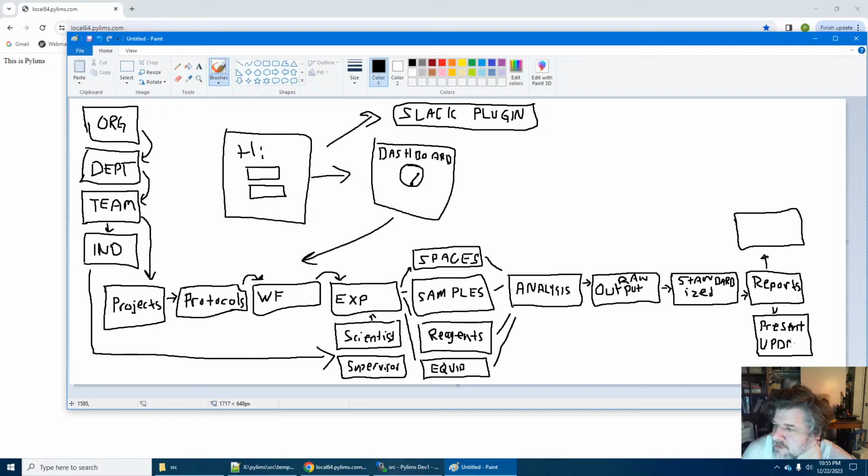Maybe the project's not finished but you want to give an update on it, so you create almost like a release, a checkpoint type thing. Then you have a white paper or something, or a publication. Maybe I'll just put publish. And then instead of that, I'm just going to do complete. So whatever your completion condition is.